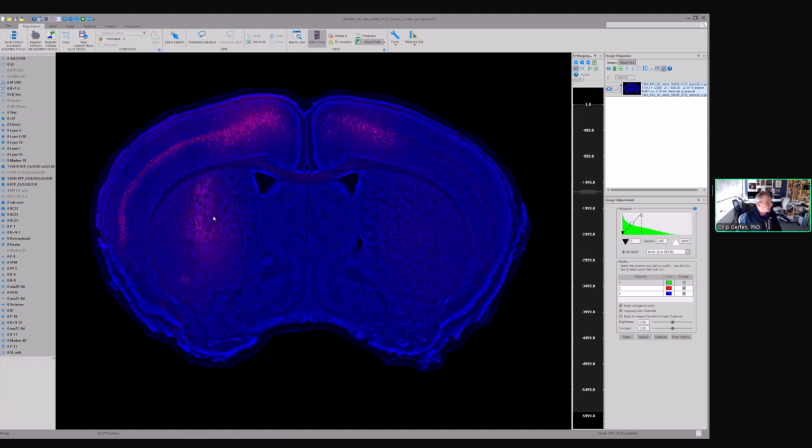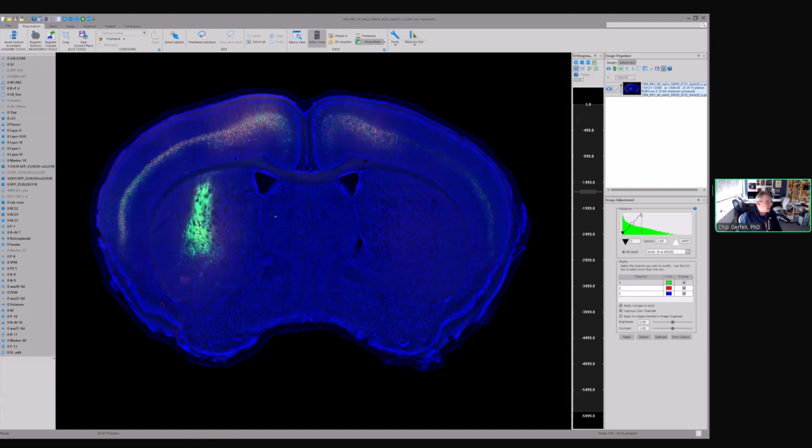In this case, we've been able to infect the D2 neurons in the striatum with the second type of bird virus receptor, and then inject the second type of rabies virus. And so we can label the D2 neurons and the cortical neurons that project to those. We can label at the same time the inputs to two different populations of cortical neurons that project to either the D1 neurons or the D2 neurons in the striatum. So that's the experiment that we've done.